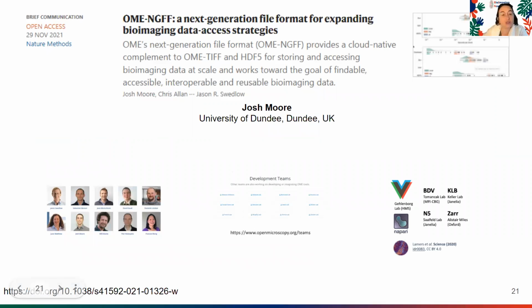And leading on to that, Josh Moore from the University of Dundee, and one of the leading forces in the Open Microscopy Environment community, is going to tell us about their effort to develop next generation file formats, which are some of the implementation level aspects of how we collect all of this information at the level of the file, so that then it maybe can be deposited in these repositories. So please. We'll keep our fingers crossed.